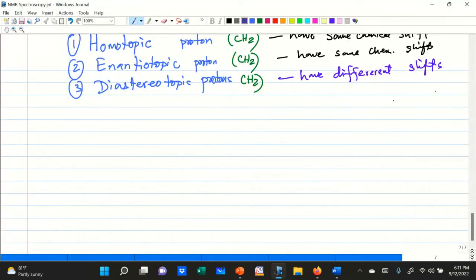So what we are seeing is spin coupling, also called spin-spin coupling, because the spin of one proton is coupling, meaning interacting, with the spin of the neighboring proton.